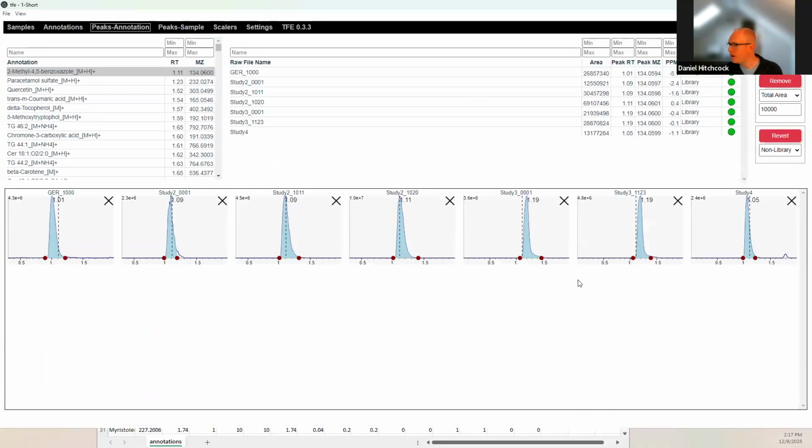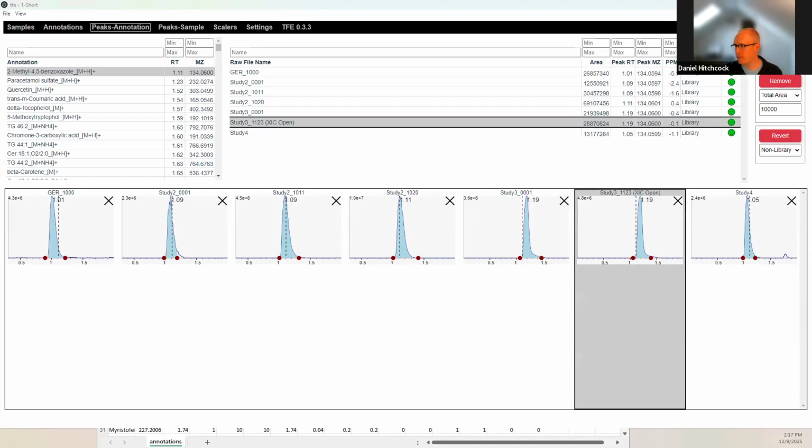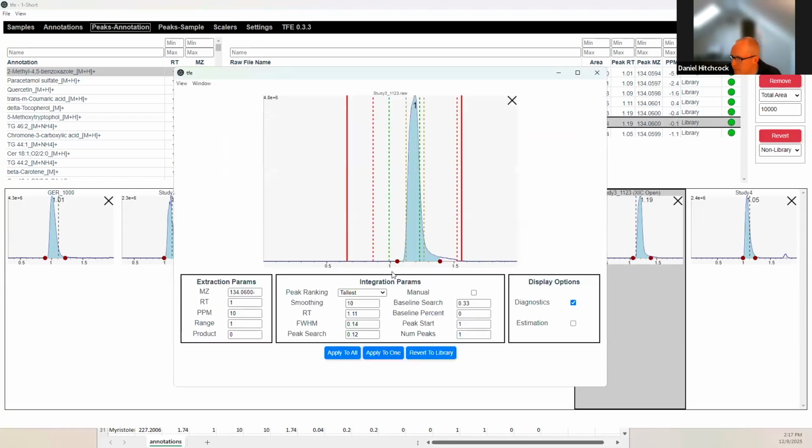So a couple things you'll notice. This looks okay. You can see that there's a slight tail right there, and maybe you want to grab that or not. If you wanted, you could just click and grab that over and just drag it. Or let's say you don't want to do that. You actually want to open a pop-up window and maybe, let me see.